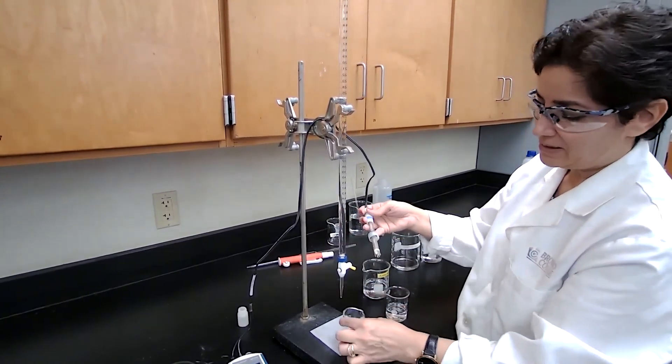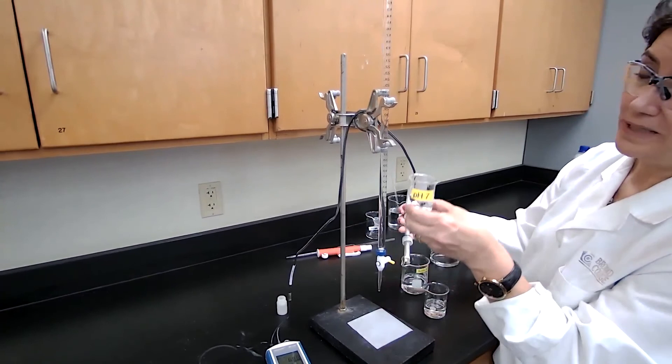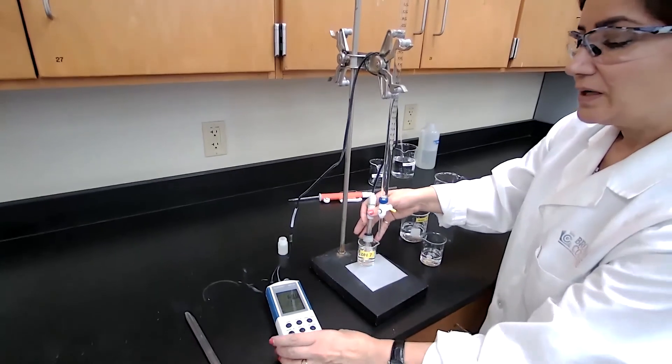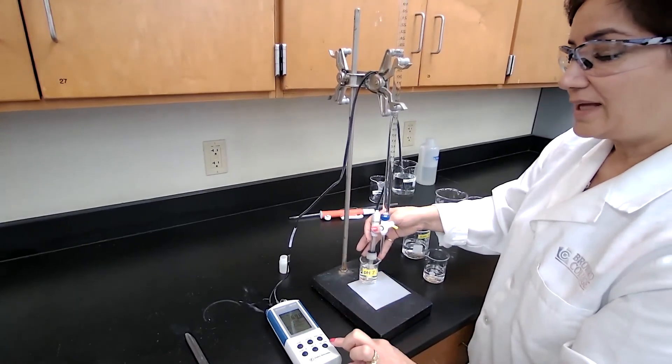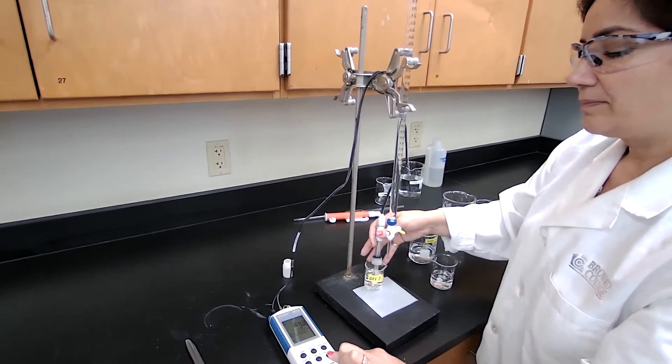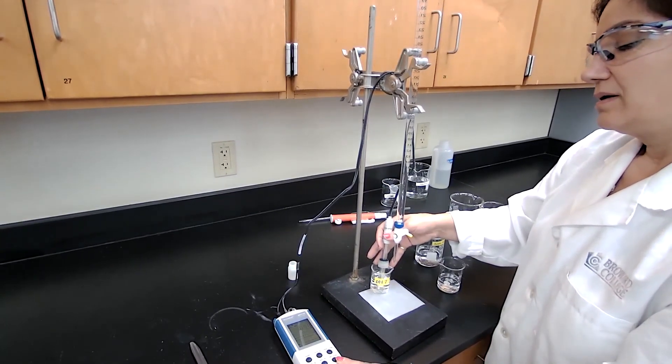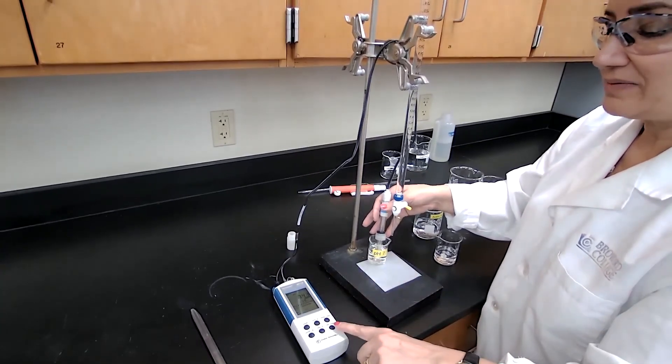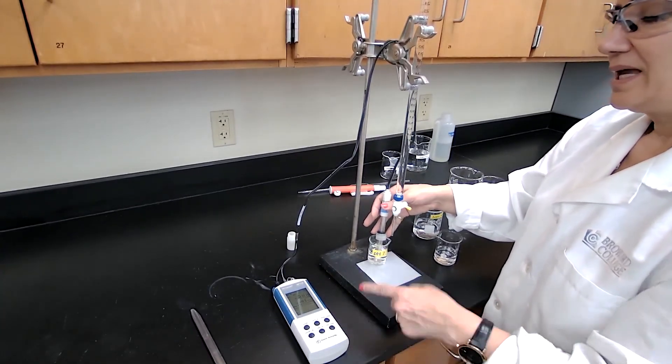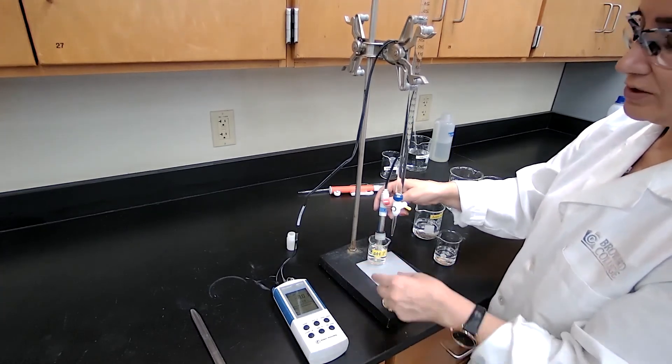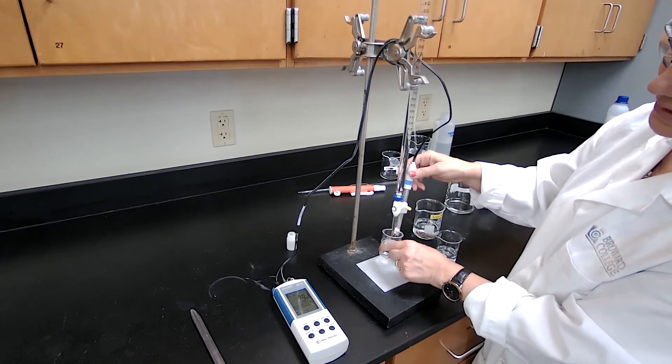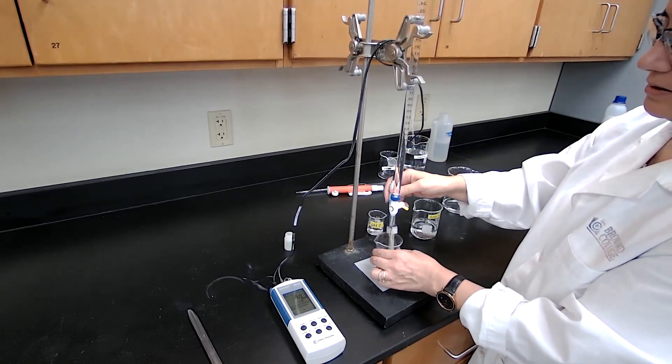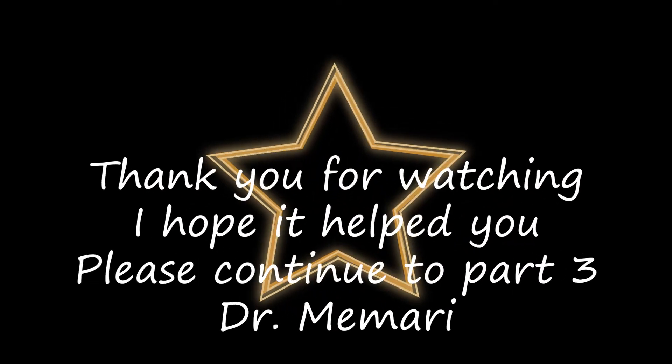First, I need to calibrate. So I'm using a buffer of pH 7. This is a buffer with pH 7. Place the cell inside the buffer. Turn on the pH meter and press on the standard once. So the machine recognizes that this is pH 7 because it's around pH 7. And when I press it a second time, it would give me a pH of 7.0. That's basically calibrating my pH meter. I place the pH meter inside the beaker of the acetic acid.